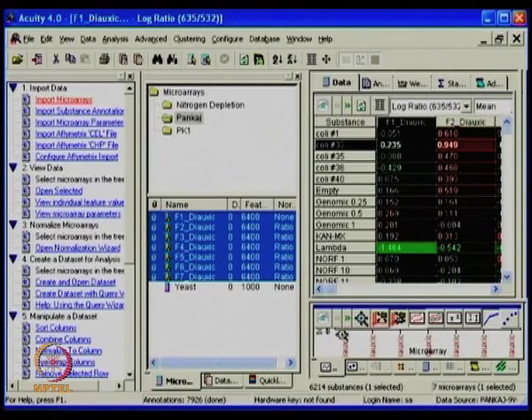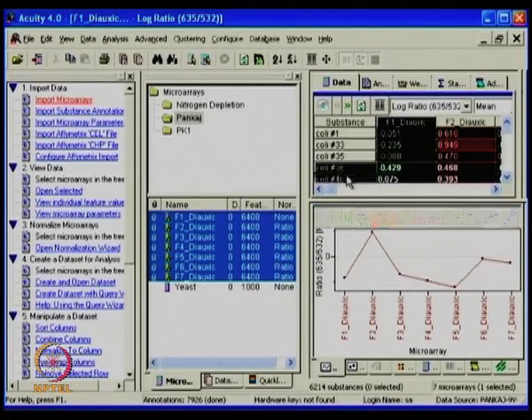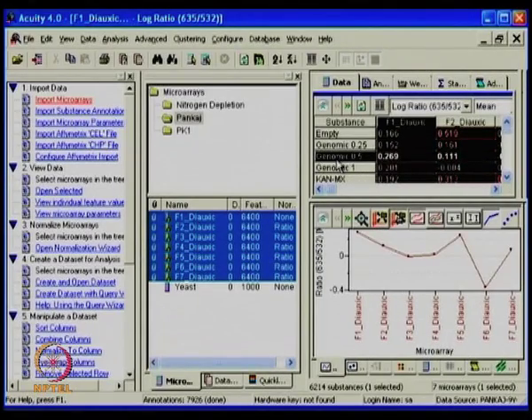So down below, if I just click on the profile button, based on what I have selected, I can look at the different profiles and how they have behaved. In this fashion, immediately I know my parameter file, what each one is, and I see that okay, this is all normal, averaged. In one of the cases, it went up. Similarly, different features can be individually analyzed and then checked for how the behavior is. So you can actually look at the trend for the same gene during the whole time course analysis. Correct. So you can also trace a little bit of working on the data.